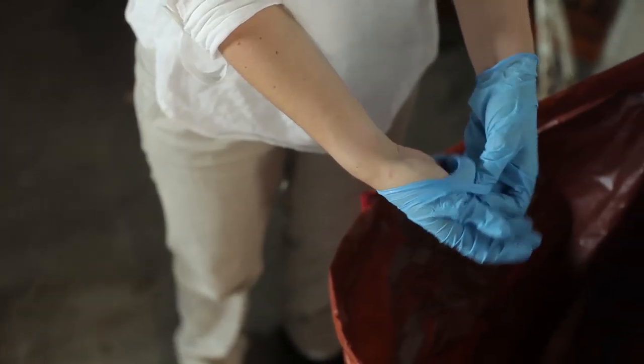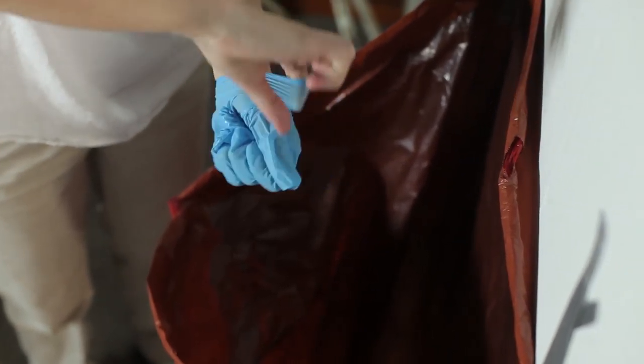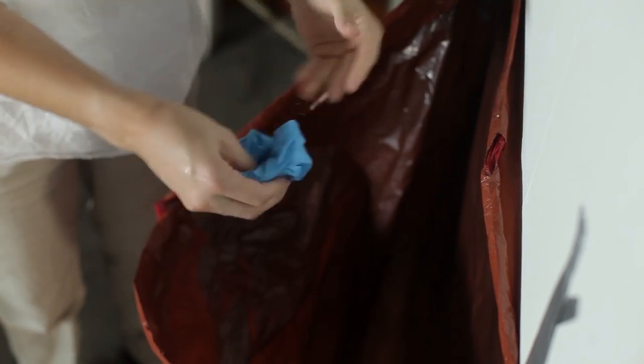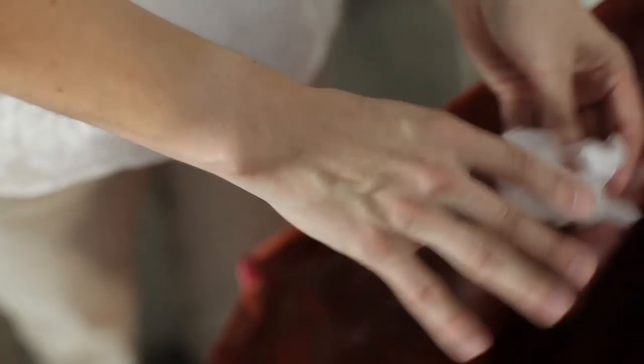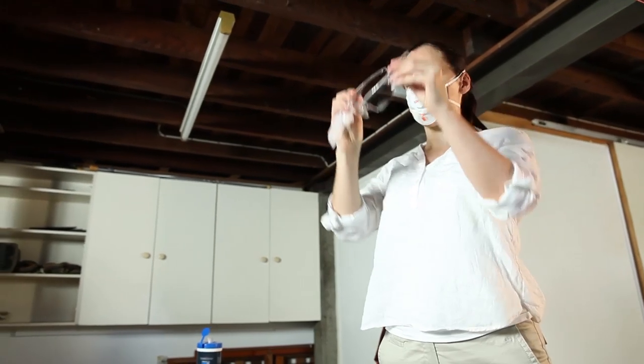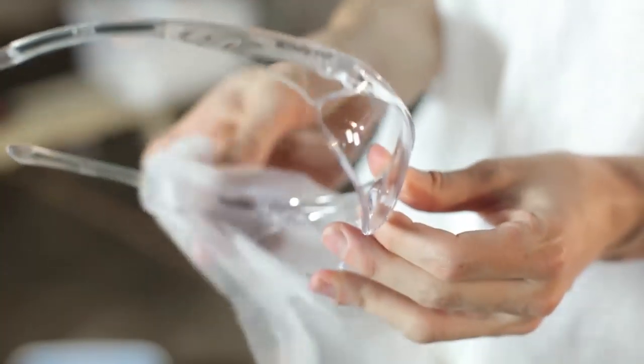When removing your gloves, grasp the palm of one glove near your wrist and carefully peel it off, turning it inside out. Do the same for the second glove and place both into the waste bag. Then clean your hands with wet wipes and safely dispose of them into the bag. Remove your safety glasses or face shield. Wipe them over with a wet wipe, or dispose of them in the waste bag.